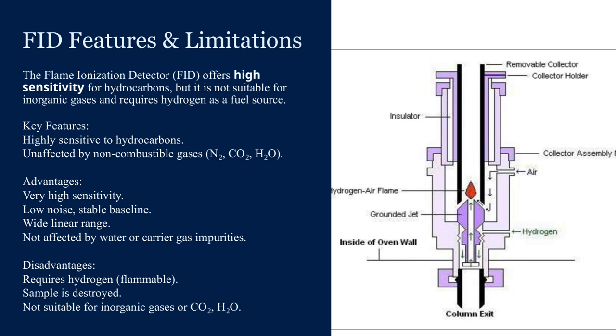Overall, the FID offers very high sensitivity, a stable baseline with low noise, and a wide linear range, making it a powerful tool in analytical chemistry. But, as with any technique, it's essential to be aware of its limitations, especially regarding the need for hydrogen and its inability to detect certain gases.